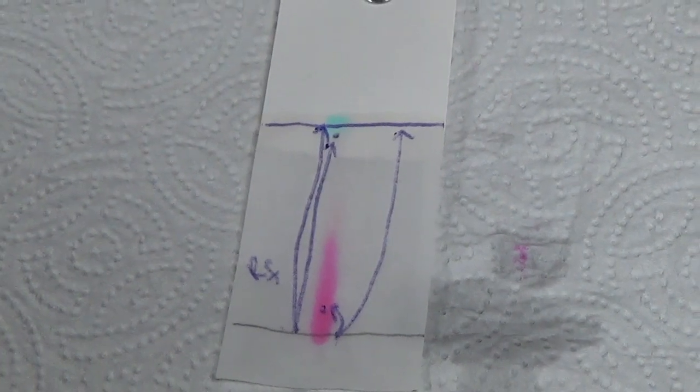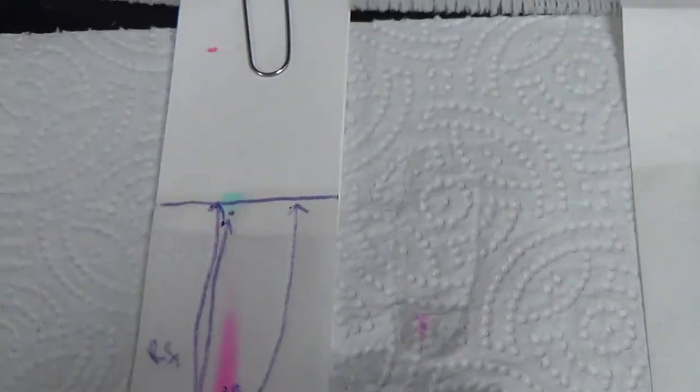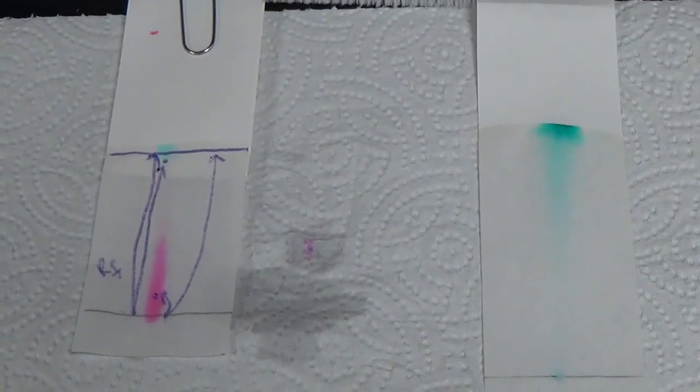Okay, so that's paper chromatography, and that's what you need to do tomorrow. So you're going to set it up tomorrow with your assigned color. I'll assign you a color. You don't get to pick. And while it's doing this dissolving thing and the water's moving up the paper, we will discuss how this actually works in great detail. All right, so this is our lab for tomorrow. Be sure you have paid attention and are ready to go.